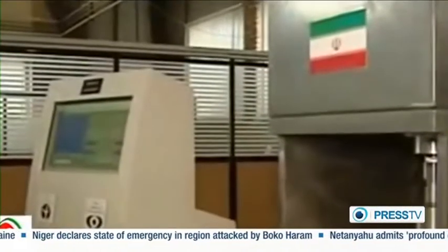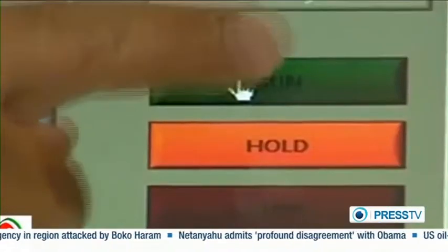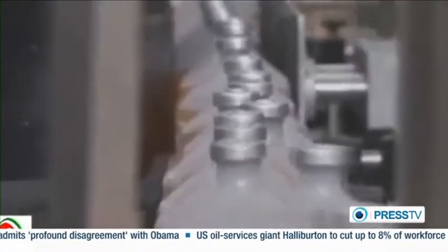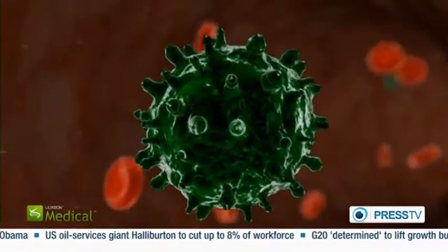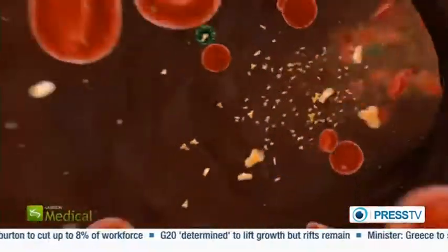The tubular centrifuge is finding an increasing number of applications because of the high centrifugal fields it produces. Centrifugal force has been known to be a good way to separate impurities from solutions that will be made into biotechnology products. Uncentrifuged vaccines contain a large amount of non-essential and harmful materials that can be removed by tubular centrifuges.